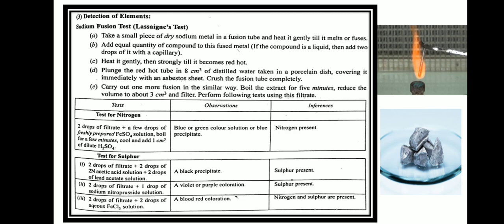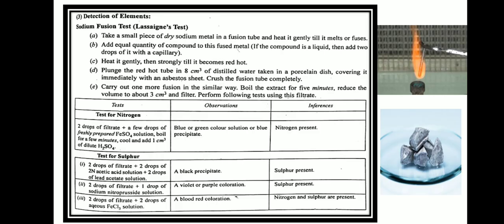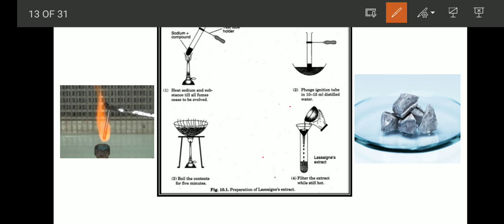Note that sodium metal is very reactive, so handle it with care while performing this test — sodium metal is always stored in oil. This is how step by step we prepare the Lassaigne's extract. Step 1: heating the fusion tube. Step 2: plunging the fusion tube into the porcelain dish. Step 3: boiling to reduce the volume. Step 4: filtering the filtrate. With that filtrate, we perform the tests for nitrogen, sulfur, and halogens.